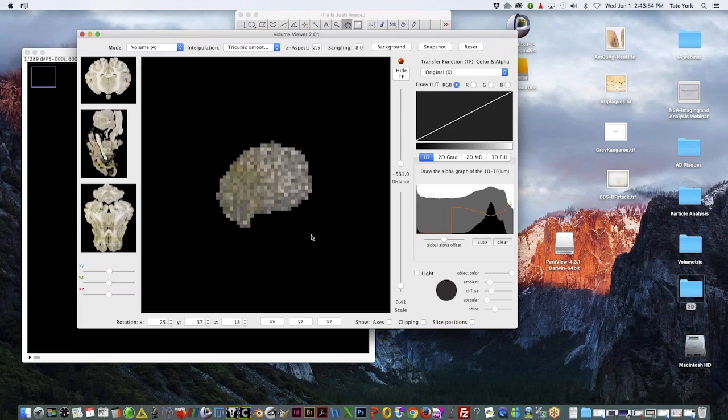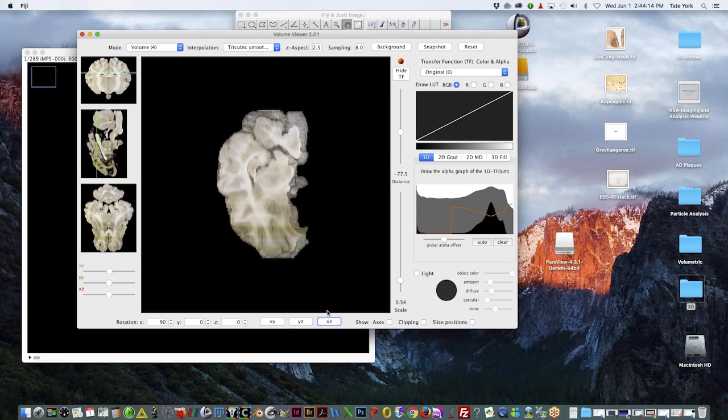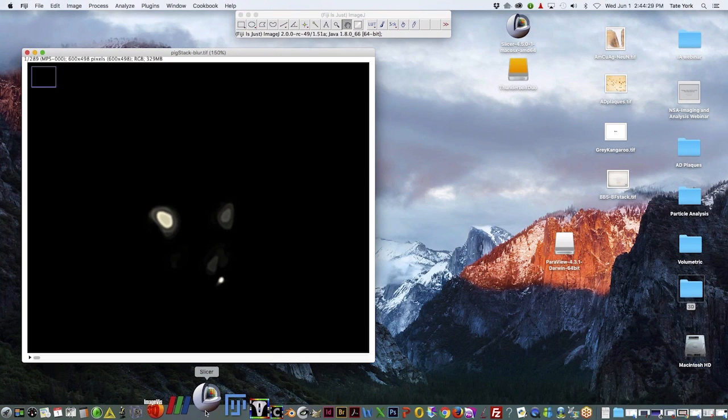They're very valuable, and as you can see, they have really good algorithms incorporated into the software that can create very good volume rendering, really good analysis tools. So let's upload that same, actually a grayscale version of this. So we've got a few adjustments to make before this looks like a brain. It's kind of squished right now. So let's change this.